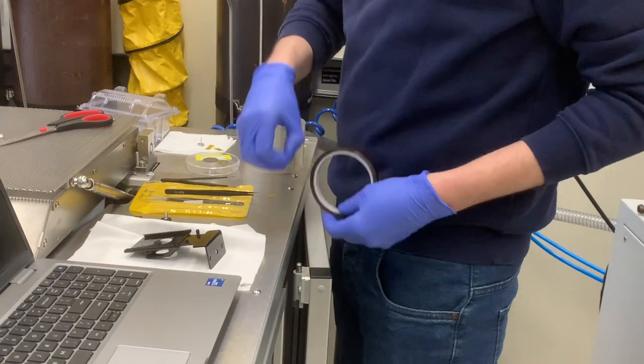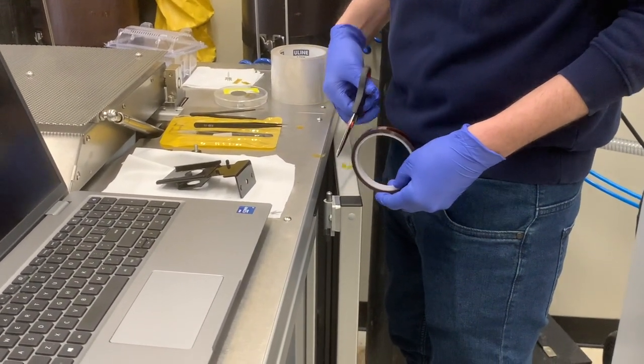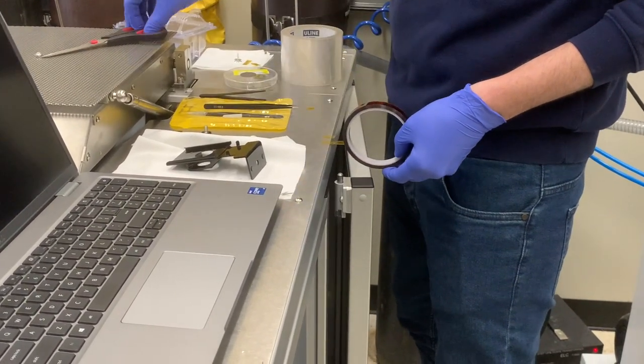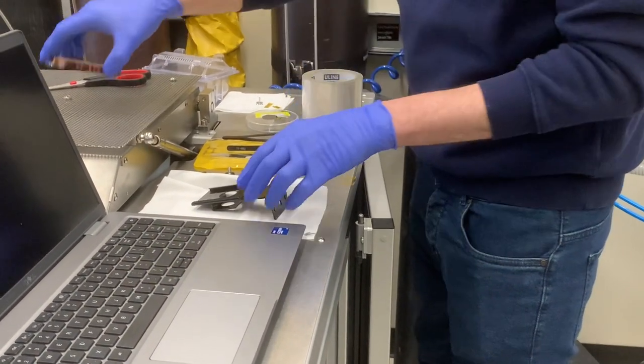I have a question. Let's say we are measuring some liquid and it's getting dirty. How are you supposed to clean it? Is it easy to clean? Well, first I would just wipe with a good wipe and then see if the background is good. But if not, a tiny bit of isopropyl, something like this.